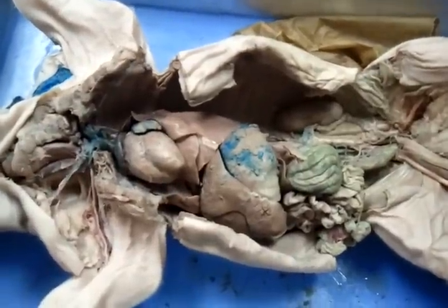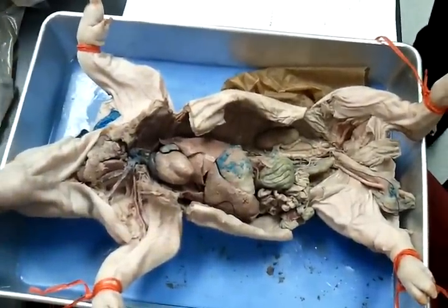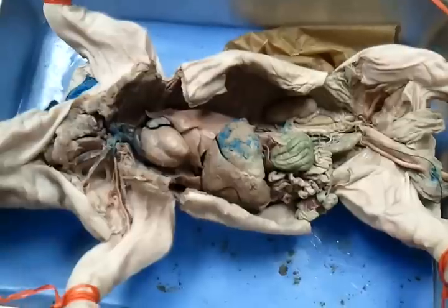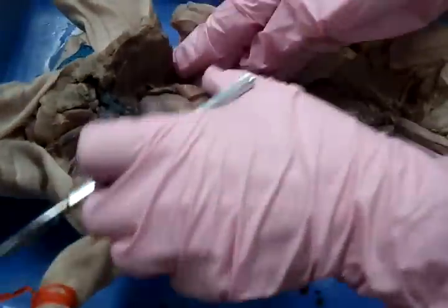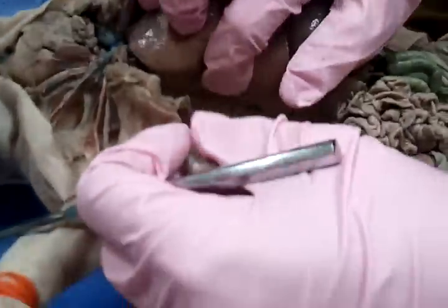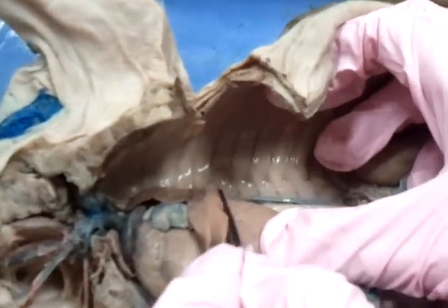When we're doing these vessels, we want to make sure of the order they come off the aorta, and also look where they're going to and coming from. There's a bonus vein called the azygos. The azygos is going to drain part of your thoracic wall. If you push everything in the thoracic cavity to the side, see that vein running like that? That's your azygos vein. So that might be a bonus vessel.